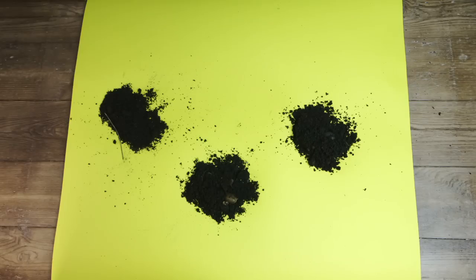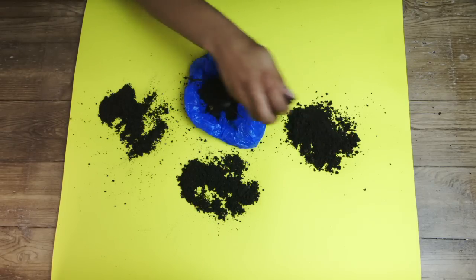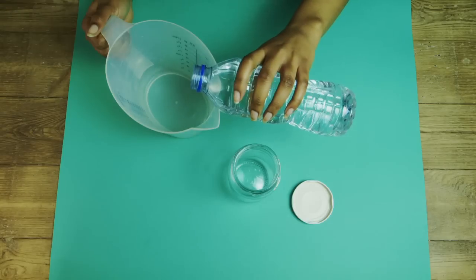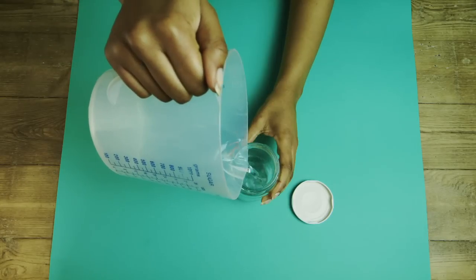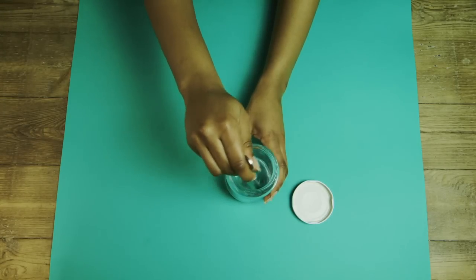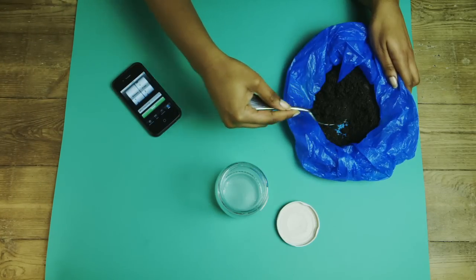Collect small soil samples from different areas of your patch and put them in your plastic bag. Remove any stones and mix it up. Measure out 40 ml of water into your jam jar. Add 2 of the settling out tablets and give it a stir until all the bits have dissolved and the water's looking clearish again. Put a teaspoon of your soil in the water.